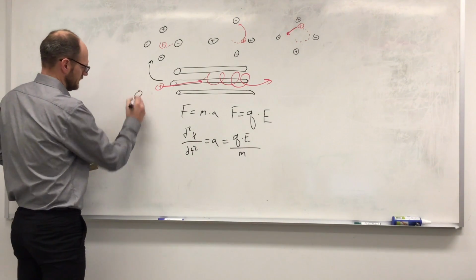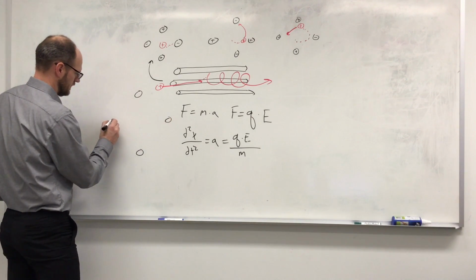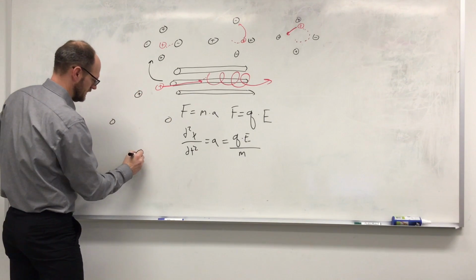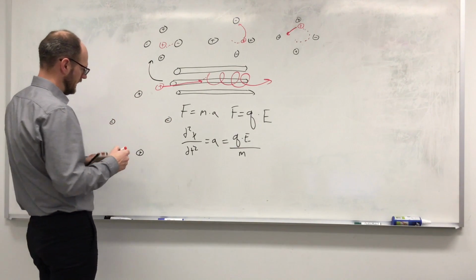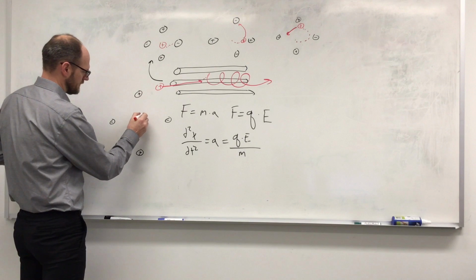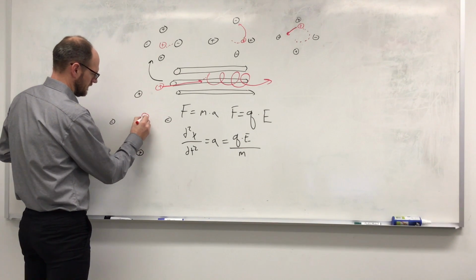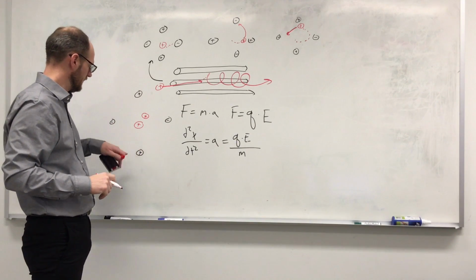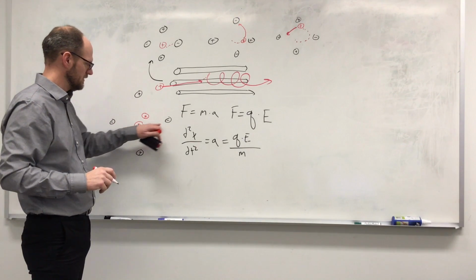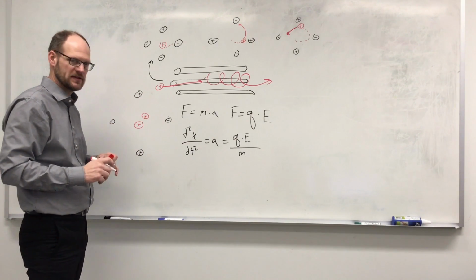So if you go back here and look at our quadrupole, you've got positive charges here, your negative charges here. You've got your ion sitting here in the middle. You've got 2 different flavors of it. If they're the same mass and the same charge, they will respond equivalently to changes in the polarity on these rods. They'll move towards them at the same rate.